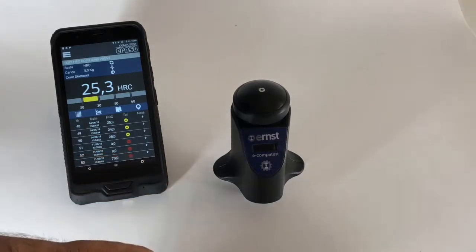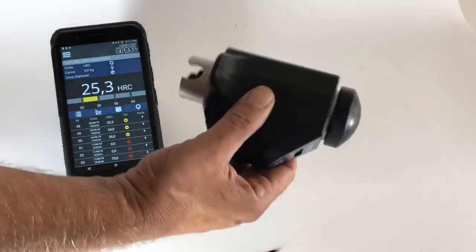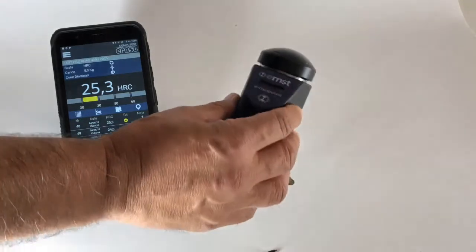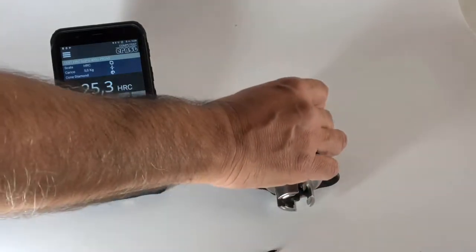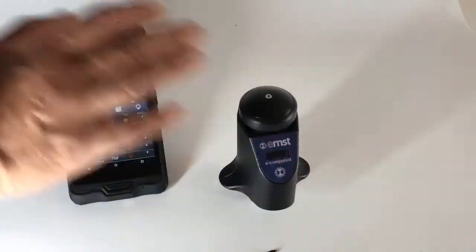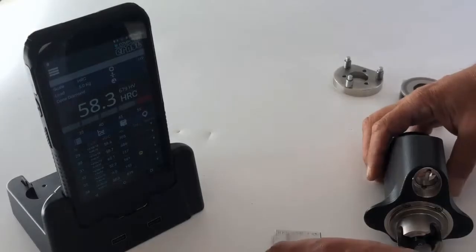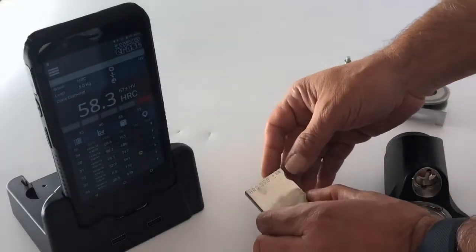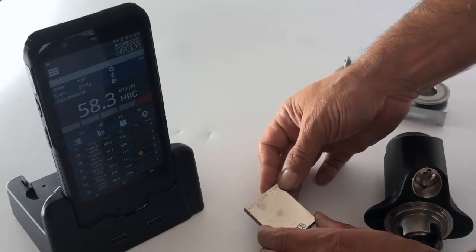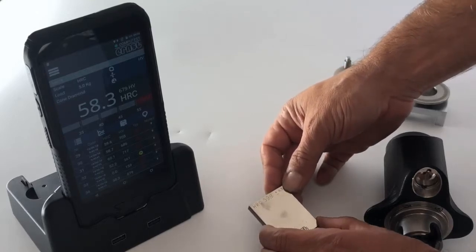As you can see, this unit has no cable, and it can also be recharged wirelessly using a special charging base. Now let's try the Compotest on a known reference sample of 59.8 HRC.